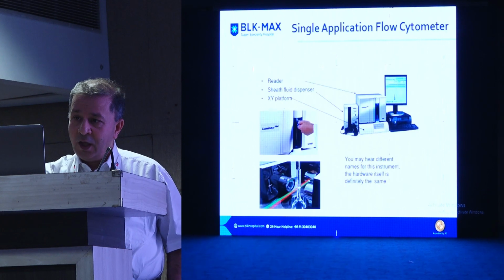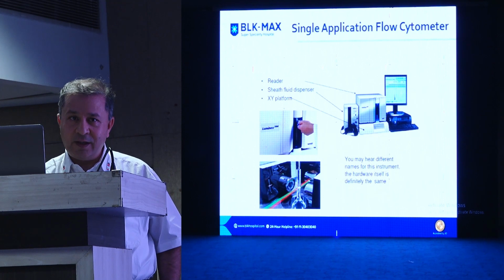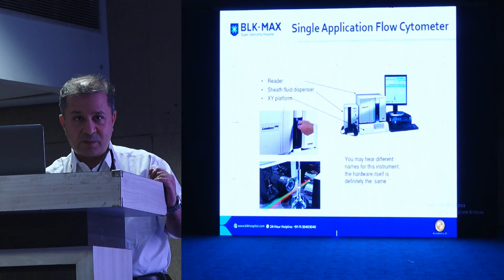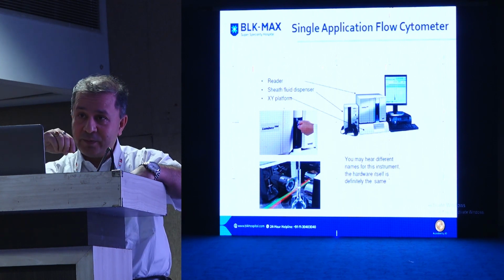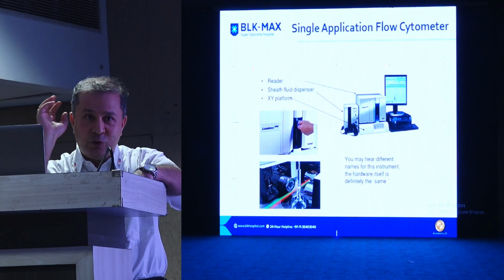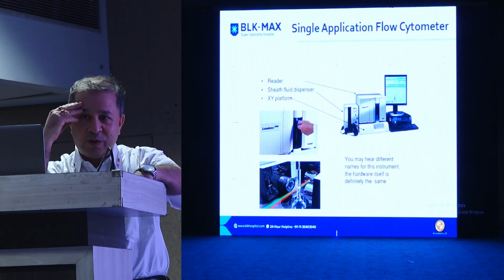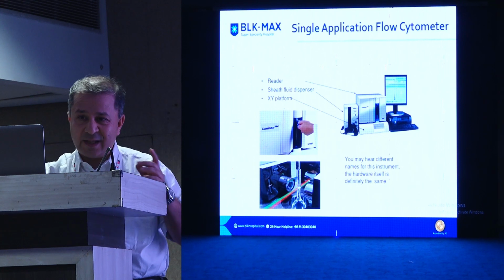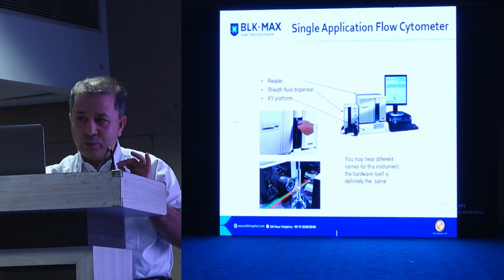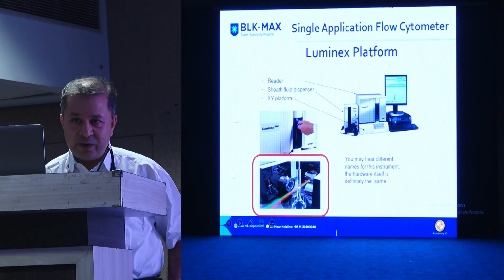Now you also have something which people keep talking about and they're always envious. What they would say is neighbor's envy, owner's pride, like in the Onida ads, you remember when I was a kid. They would say, oh my god, I have a Luminex, and the other guy would keep feeling very bad: oh, I don't have a Luminex, what will I do about it? But for God's sake, Luminex is nothing but a single application flow cytometer. It's also a flow cytometer, and if you look at it properly, this is nothing but a flow cytometry platform as well.